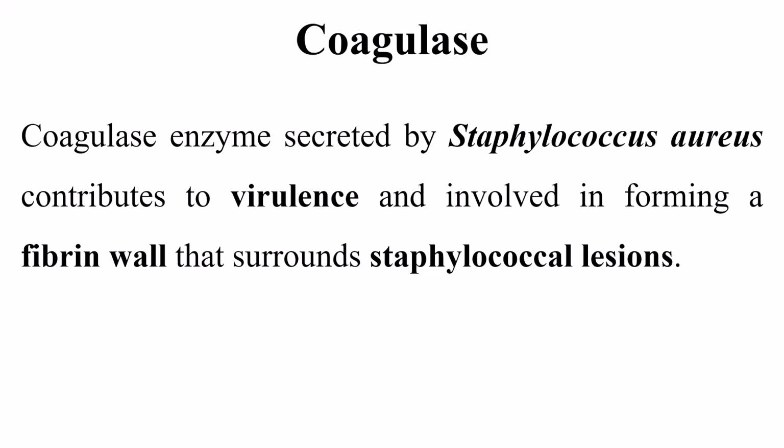This enzyme is produced by Staphylococcus aureus and contributes to its virulence factors, and it is involved in forming a fibrin wall that surrounds the Staphylococci lesion.